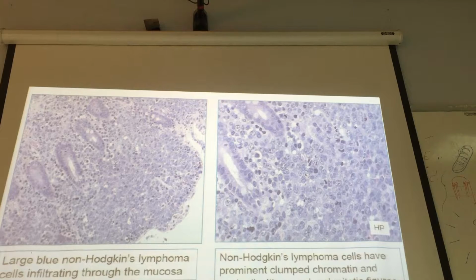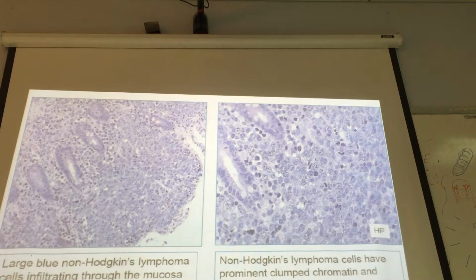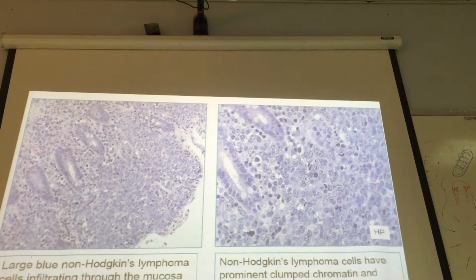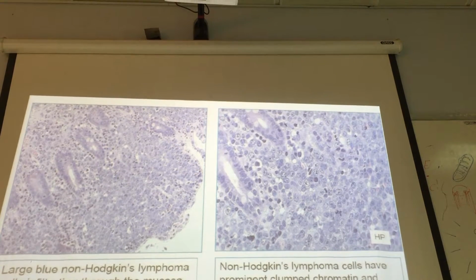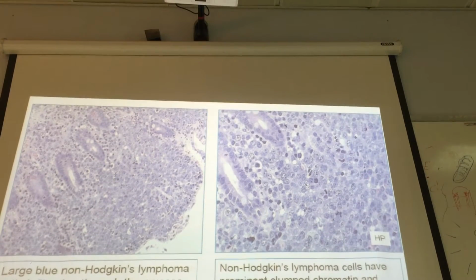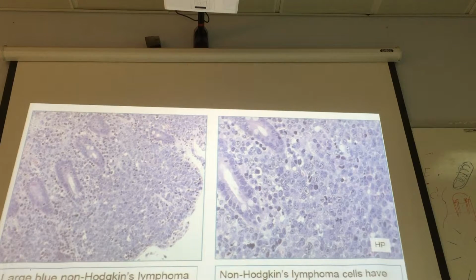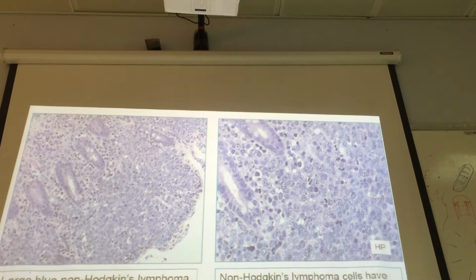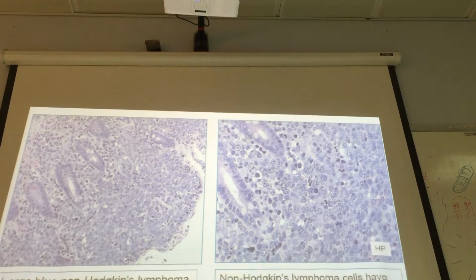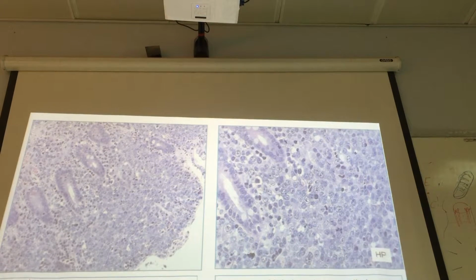The most common is the MALT lymphoma in the stomach, which occurs in the setting of H. pylori induced chronic gastritis. So we don't have to take it lightly. The chronic gastritis is caused by the H. pylori infection. It is common here also, I think. If this is occurring, it can later on progress to carcinoma. So you have to be careful. It can go into carcinoma, gastric cancer, or it can progress into this lymphoma also. So two things can happen.